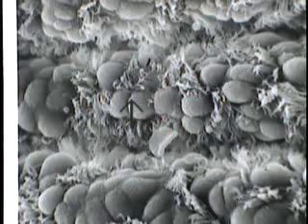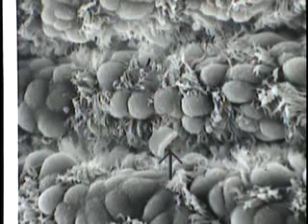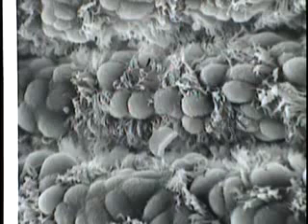In addition, it is showing the tops of other epithelial cells forming the epithelial lining of the bronchiole, and these perhaps could be Clara cells. Nonetheless, at this point, all one can say is these are the apices of several non-ciliated cells together with the ciliated cells in this small bronchiole that's being observed. This structure here, though it's folded over, was an erythrocyte, and it gives one a little bit of perspective as to the size of these cell apices.